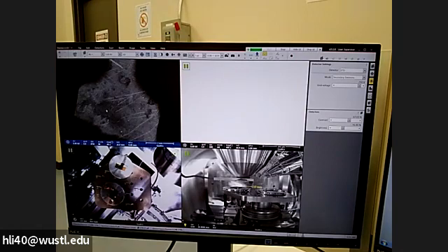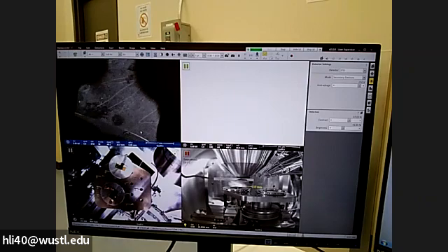So this now, I don't know whether it's on the silicon wafer. I put on the sample, I put it on. I can drive around. To drive around, you can double click the place you click will move to the center.